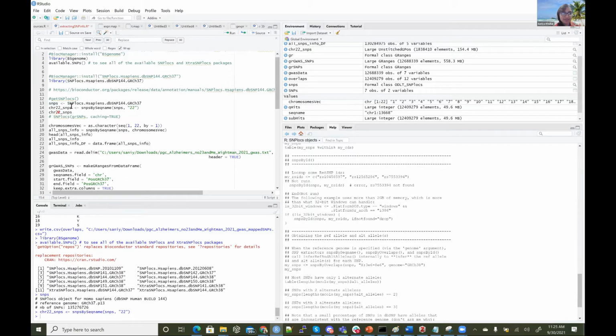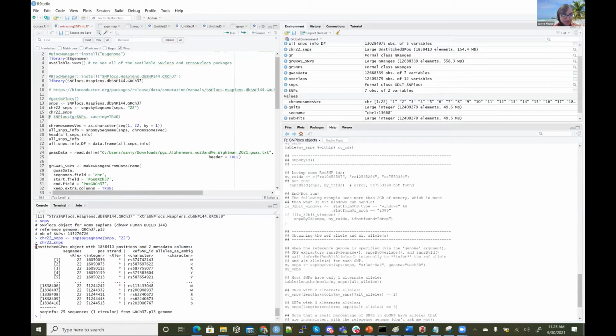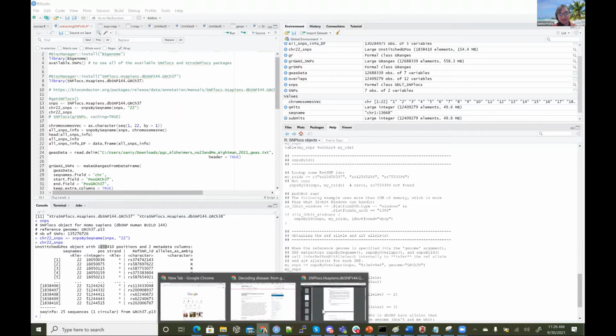And what you'll see is that this is chromosome 22, with so many different SNPs here. It's a small chromosome, because you can see the chromosomes shrink in size along the karyotype as well. So we have 23 pairs of chromosomes, and they usually tend to get smaller in size.